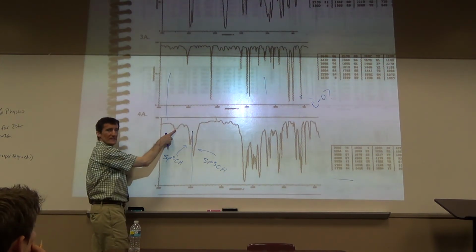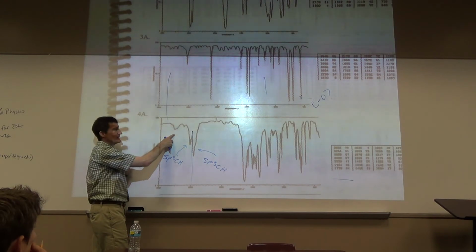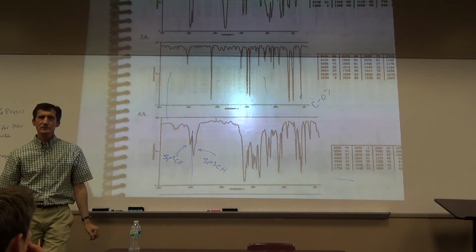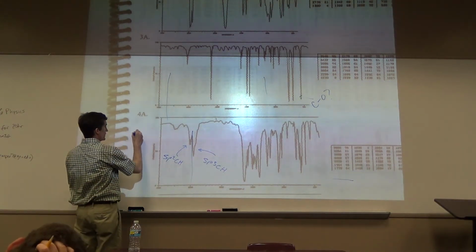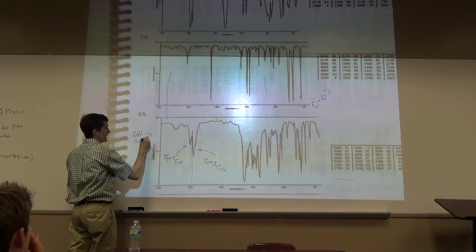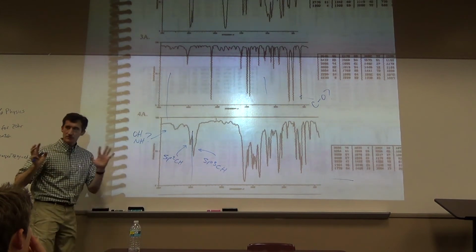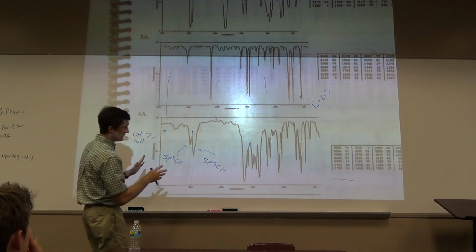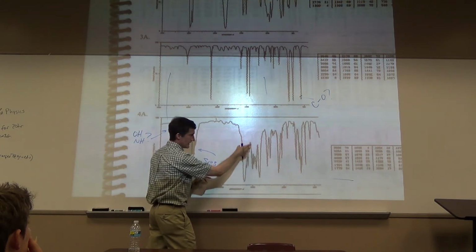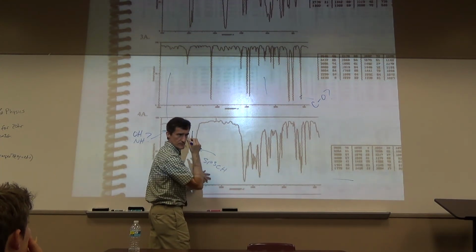Does this really look like a peak? There's no NH or OH peaks. It looks like an overtone. It almost looks like water. So you could maybe write something like this: OH, NH, just kind of question it at this point. Okay, what else do we see? There's no carbonyl? Yeah. How do you know that's a carbonyl and not something else?